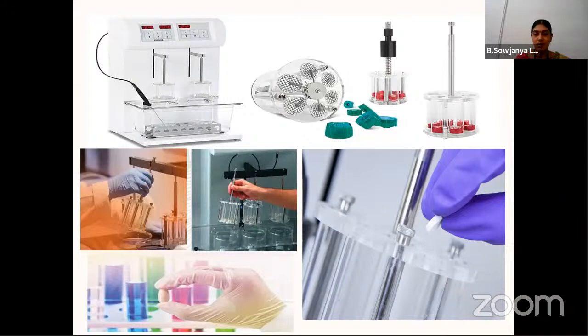The green one is the plastic disc placed during the disintegration process, because floating of the tablets over the glass tubes is to be avoided by adding these plastic round discs.